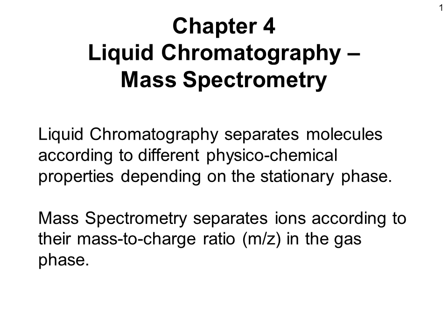Chapter 4 is about the combination between liquid chromatography and mass spectrometry. In the first part, we'll learn about mass spectrometry and later on the combination, or hyphenation, as it is also called, with liquid chromatography. Liquid chromatography mass spectrometry, also abbreviated LC-MS, is probably the most widely used method in bioanalysis to date.